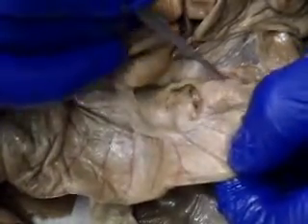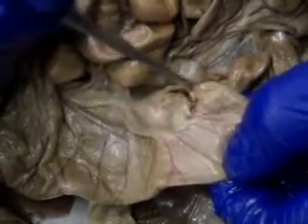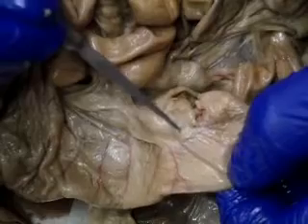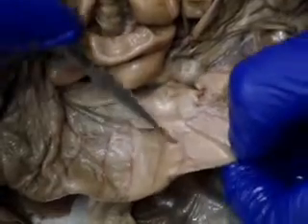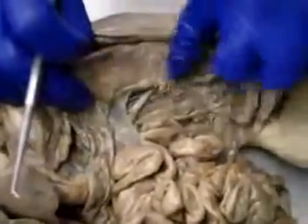If it's laid out like so, we're seeing this little piece right there, just kind of sticking off by itself. That is the cecum. There's actually a lymph node right next to the cecum right there. This is the ascending colon here. This is the transverse colon here. And then this goes down right here, and that is the descending colon.